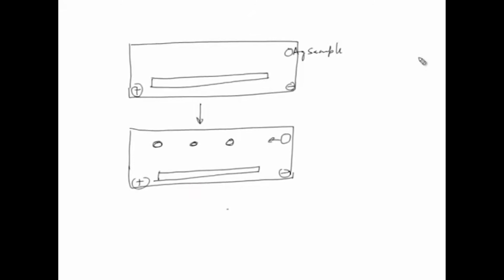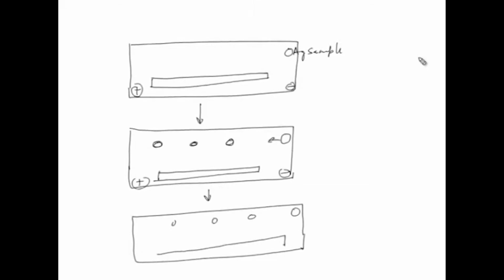So, once you have run the electrophoresis as we have discussed, the next step would be to fill this trough. What you have are these components from the antigen mixture, and you will fill in antisera, or antibody solution, for that particular antigen.